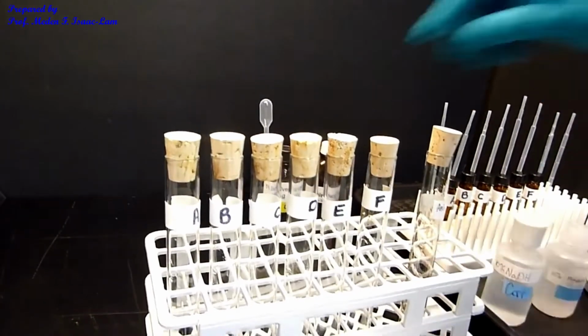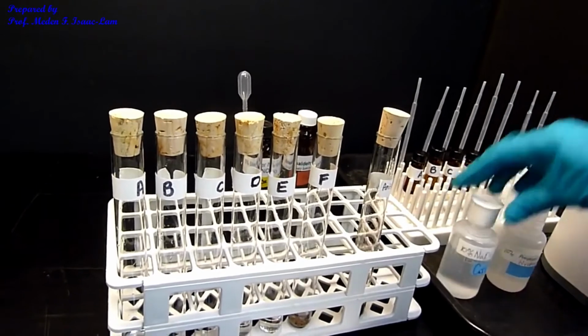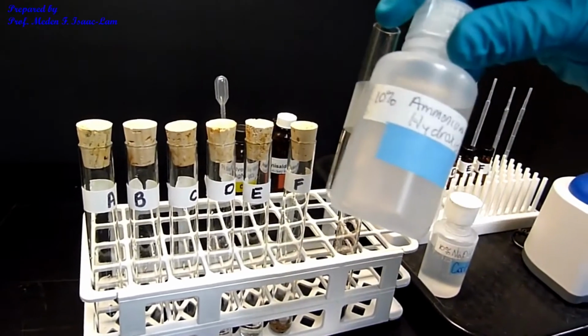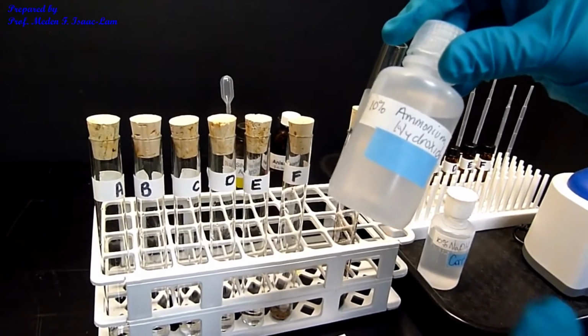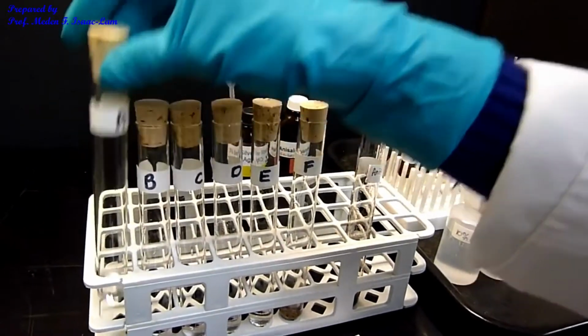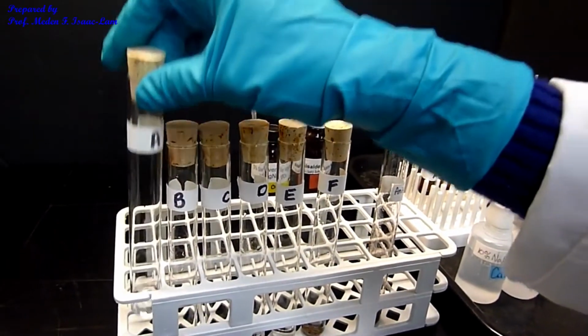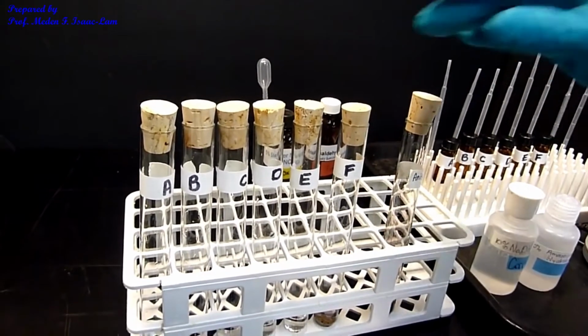So now for the unknowns, I added the silver nitrate. So I added sodium hydroxide, 3 drops. And I also added a ml of the ammonium hydroxide. And when I shake it, the brown precipitate disappears. So that is now the solution. It's clear. So I added the base sodium hydroxide and ammonium hydroxide.